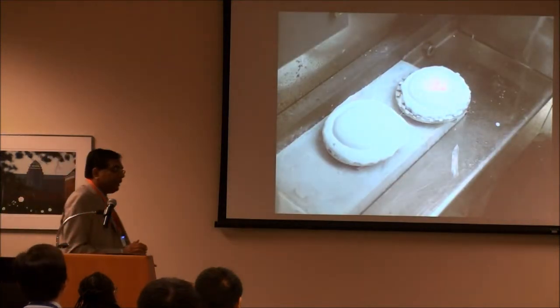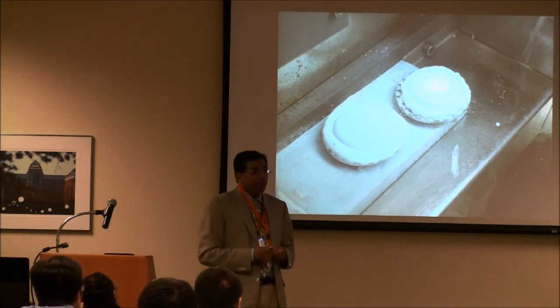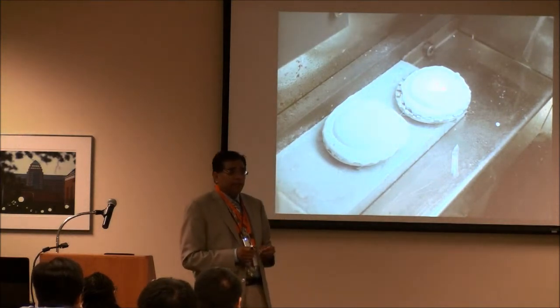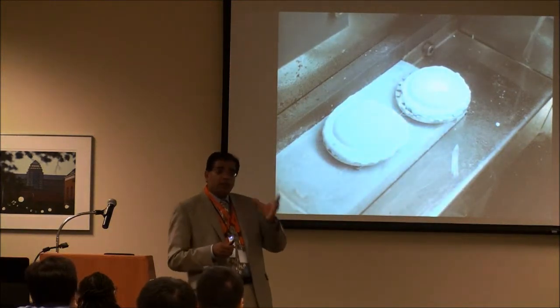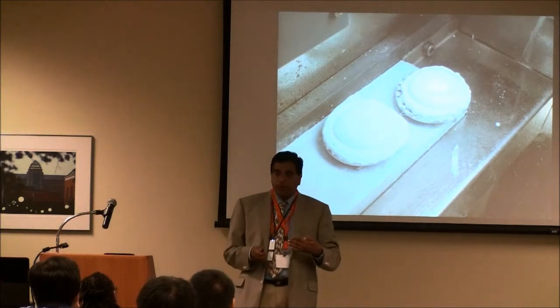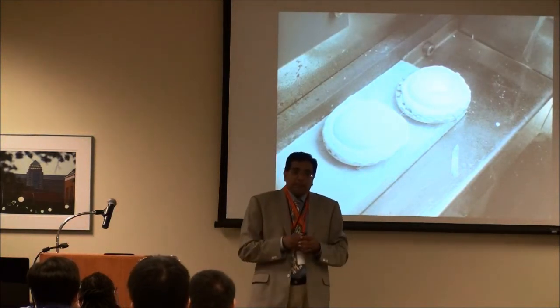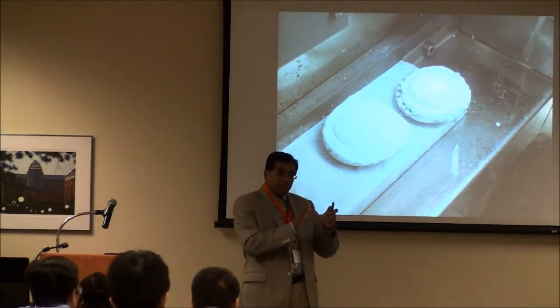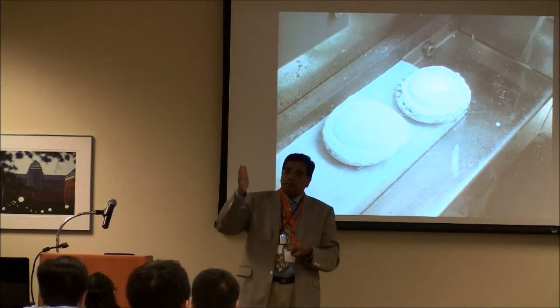You will get a chance to go to the hospital laboratory where you will see how specimens are grossed in, where they are processed, where they are cut to be made into slides. After the specimen is processed, it takes about 8 to 12 hours in a machine where it goes through multiple steps.